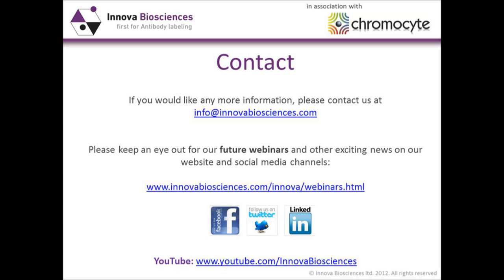And another question from, I think it's Shawan, wanted to know if you need to purify and separate unconjugated antibody or dye when using the Lightning-Link kits. And probably one of the main advantages of the Lightning-Link kits is that you actually avoid this column separation process. The kits are set up in such a way that there's no need to purify and separate out unconjugated antibody. Your resulting product after you've used the kit is conjugated antibody, and there's no other side reactions that you need to be concerned about.